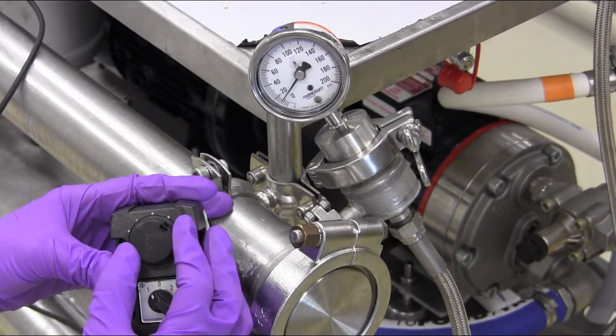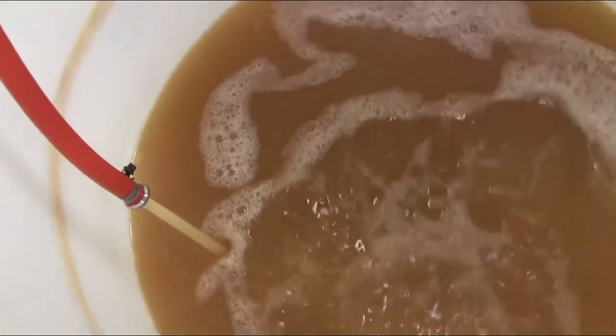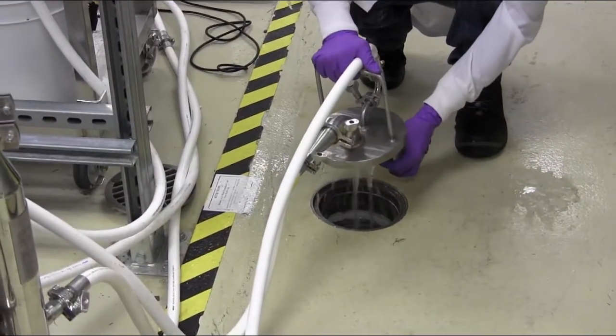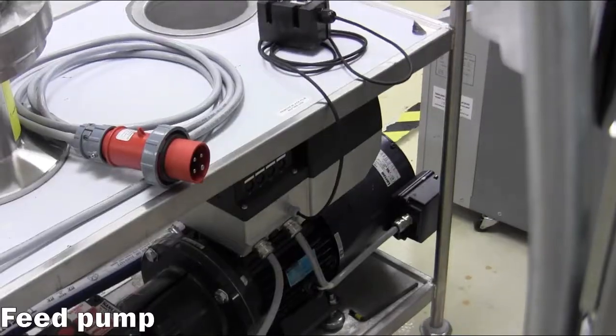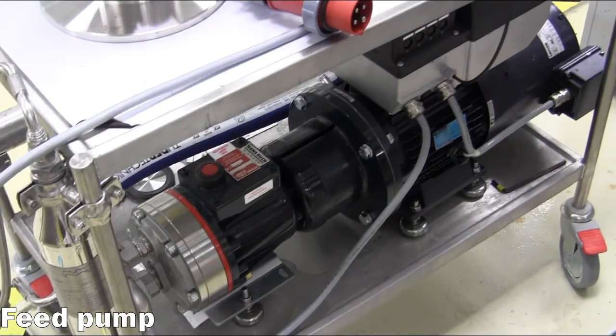This SOP will focus on utilizing the M20 with the larger filter housing to process large volumes of material in microfiltration or ultrafiltration applications. A high-pressure diaphragm pump supplies feed material and can be routed to either the flat membrane housing or the cylindrical housings.